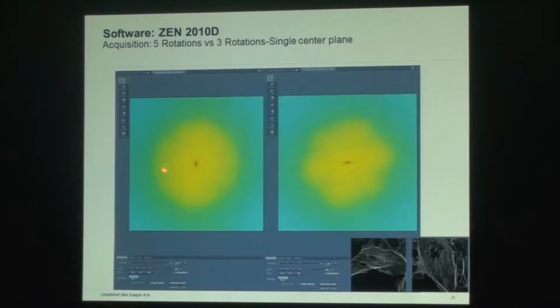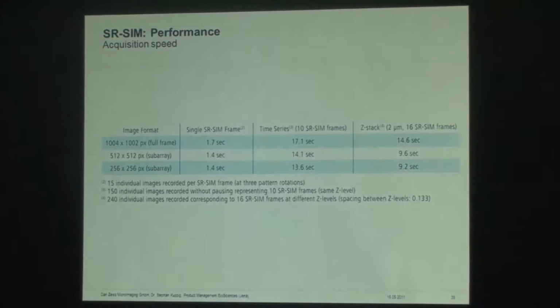As of now, you look at the more isotropic distribution of 5 rotations and the anisotropic distribution of 3 rotations, but it is not transferred into the actual image, probably because I have not used the same image. If you made an image such that you populate those areas where the intensity is low, then you will see a difference. You mean within these regions? Yes, you're using an image that doesn't have a lot of energy in those regions.